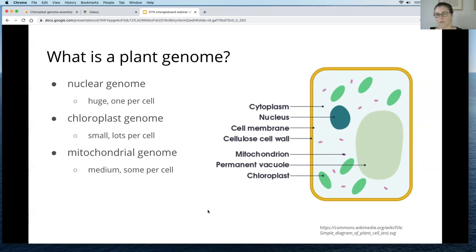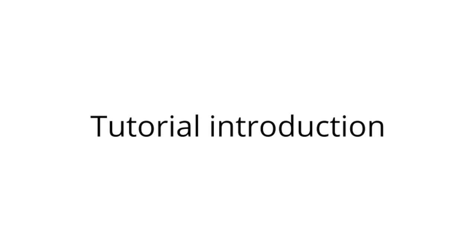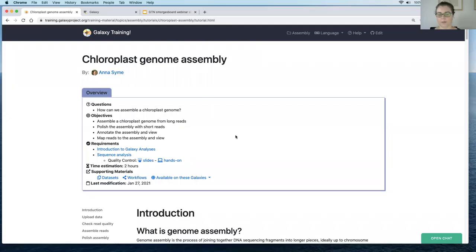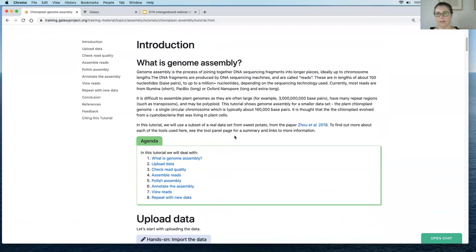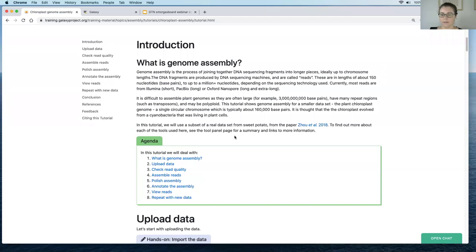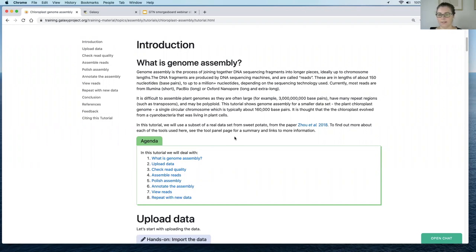Today we're going to look purely at the chloroplast genome. Genome assembly is the process where we piece together lots of smaller DNA fragments and join them into longer pieces, hopefully representing the original chromosome or chromosomes from which those reads came. In this tutorial we're using long reads from Oxford Nanopore sequencing and short reads from Illumina sequencing. The dataset is a real dataset from a sweet potato sequencing project, but cut down into a much smaller subset. The chromosome we're assembling today will be about 160,000 base pairs long.